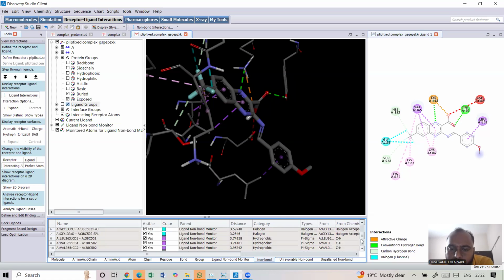So all these things are possible in a single software, where you have to do step by step clicking in a single software. That is what I am talking about. So with this I am stopping here.